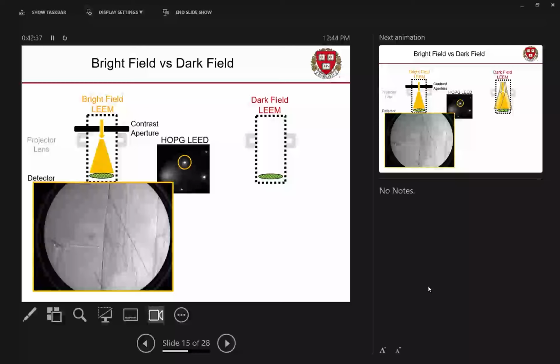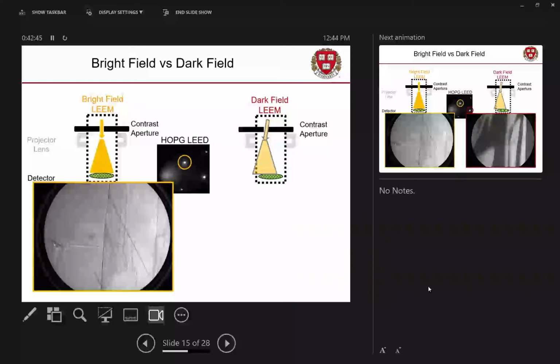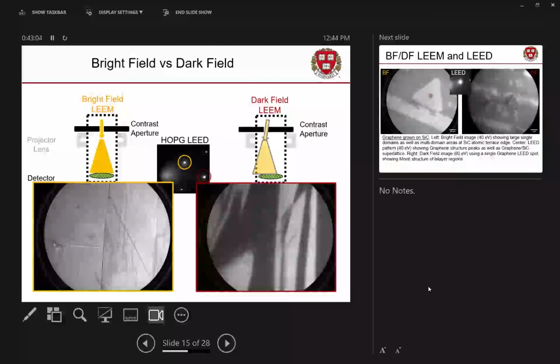But what if, for some reason, you decided to put the aperture around one of these spots? Okay, now what happens? Well, now what happens is you block everything except the electrons that fulfill that diffraction condition, which means only electrons which bounced off a part of your sample that have exactly that crystal spacing and exactly that orientation are going to show up on your screen. Everything else is going to be black, because there won't be any electrons there. And that's what we call dark field.